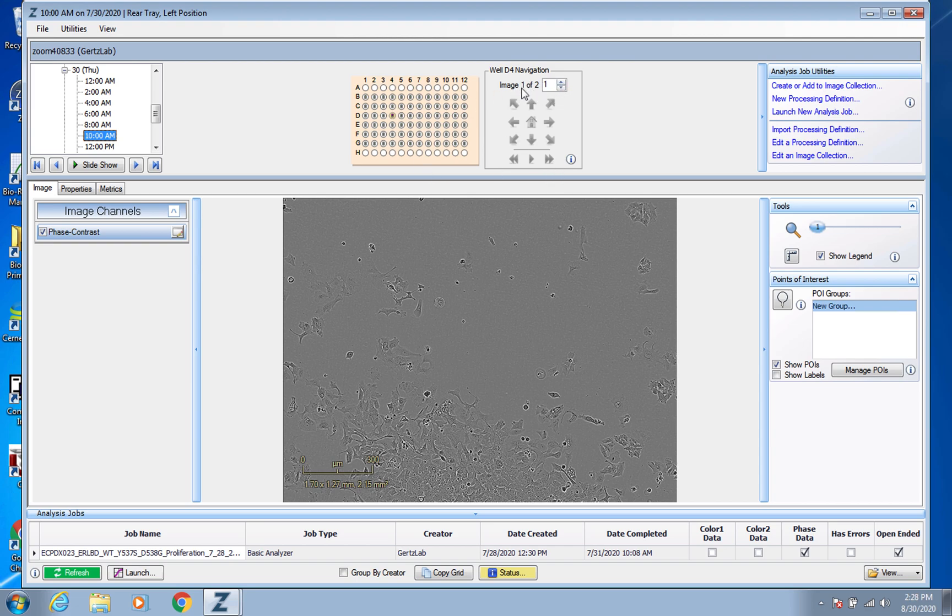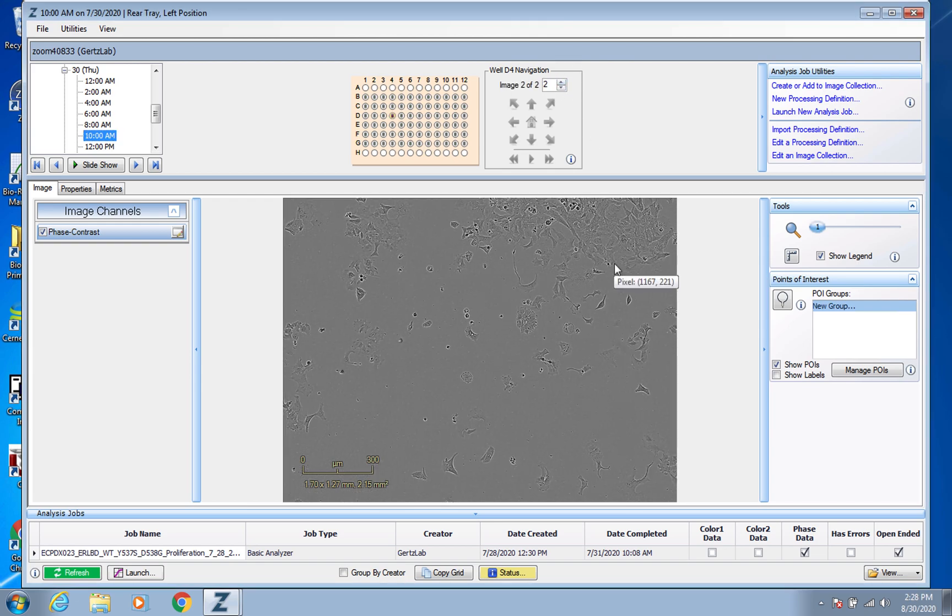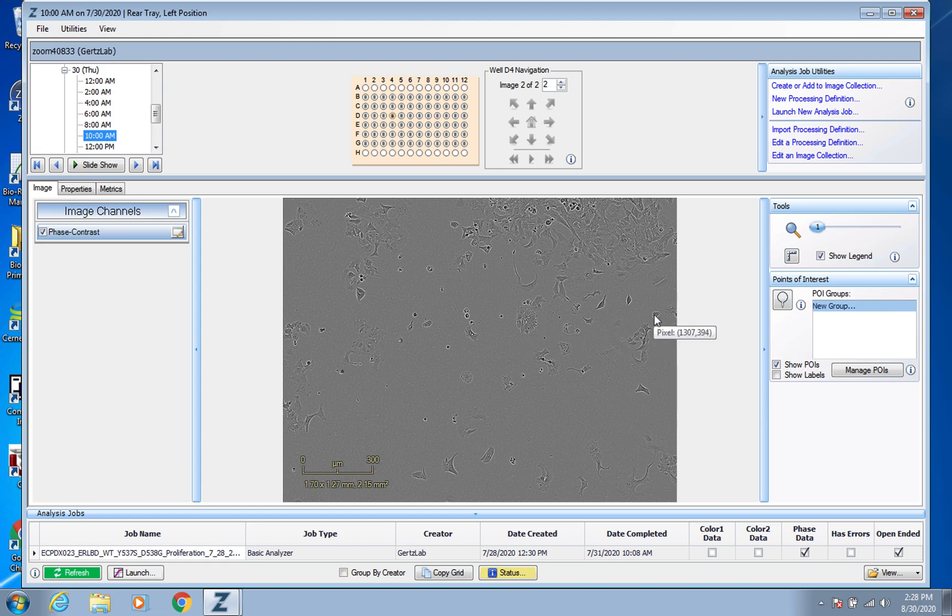And here you can even see that image one of two, because as I mentioned in the how to set up your scans video, we normally for proliferation plate do two images per well so you can see that here.